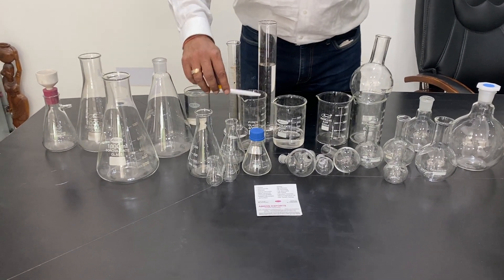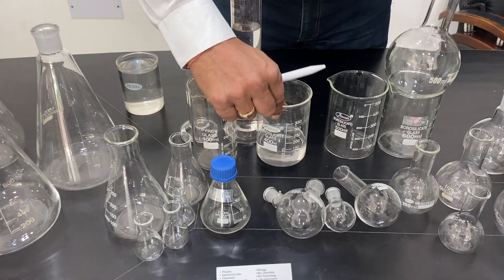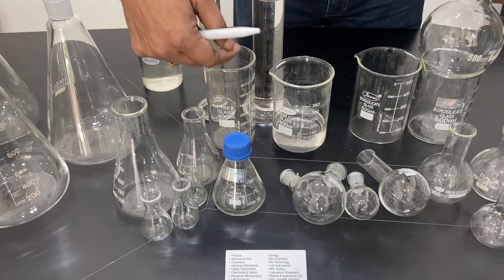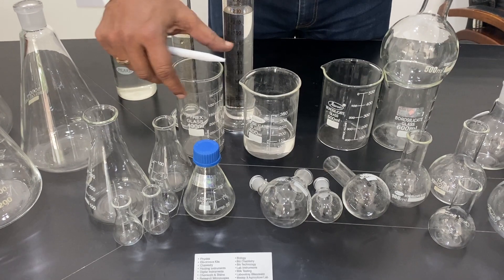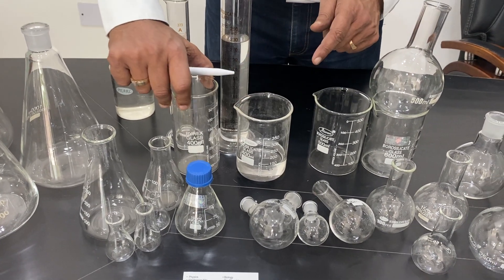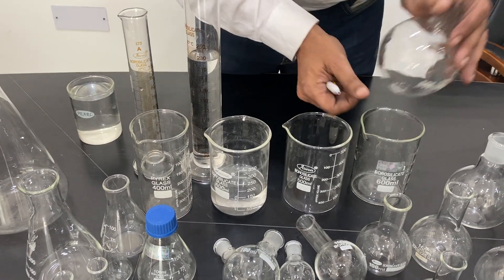These are called beakers. This is a tall form beaker — 400 ml tall form — and this is a 400 ml beaker in normal size, so there is a difference in height. The diameter is less but it has a lip and graduation. This is approximate graduation, approximate volume. These are 500 ml and this one is 600 ml.